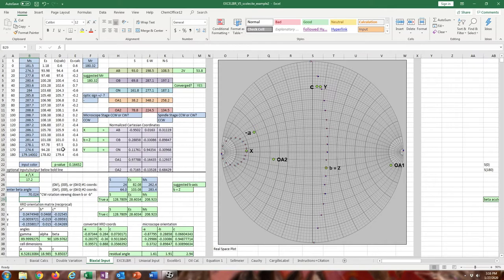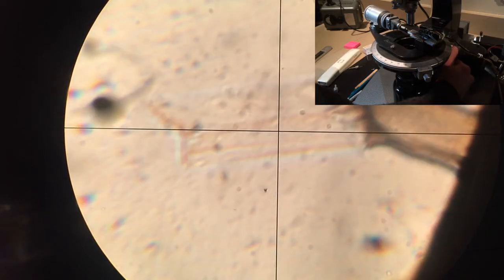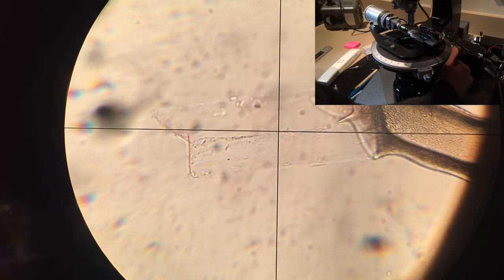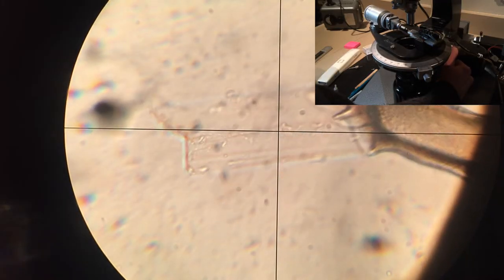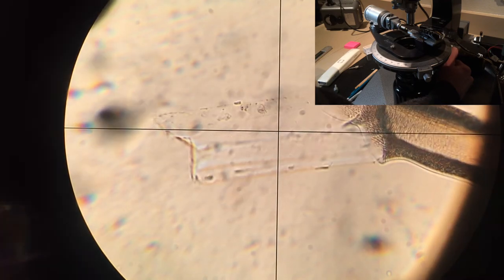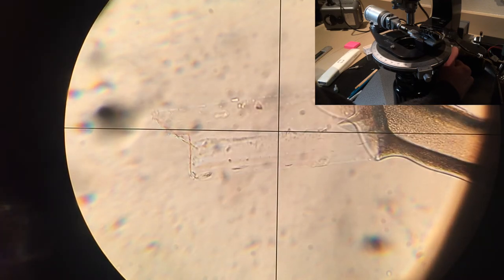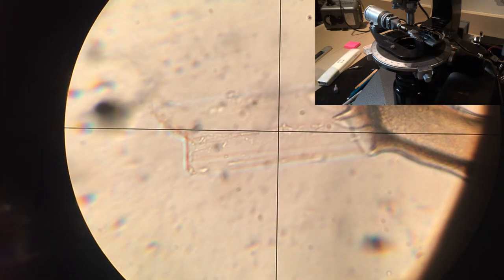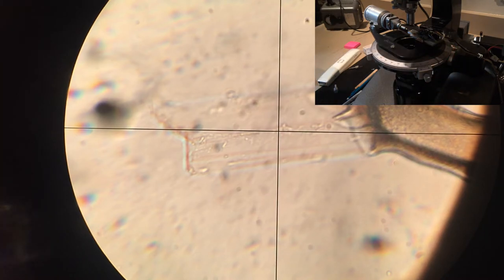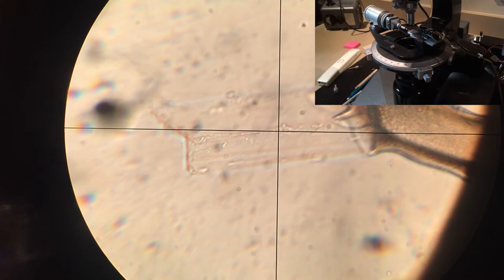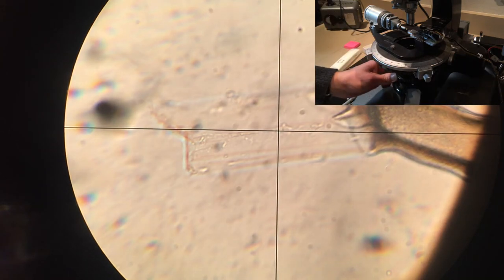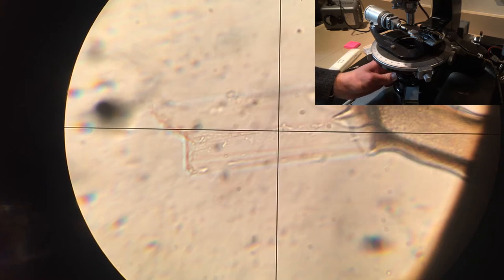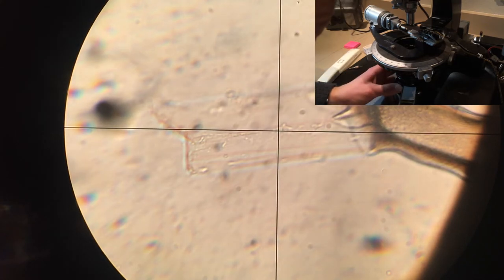As for what it physically looks like when you're doing this, you want to blur the crystal a little bit, like lower the stage. You can see that light is sort of refracting outside the crystal towards the oil as I lower it, which means I'm going to want to probably heat the oil up to lower the refractive index of the oil to make it closer to the crystal.